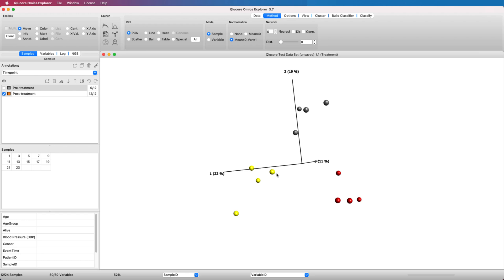We can see that the treatment groups are already clustering together, indicating that there are differences between them. In this example, we will show how to identify the variables that discriminate the samples in the placebo group from all other samples.